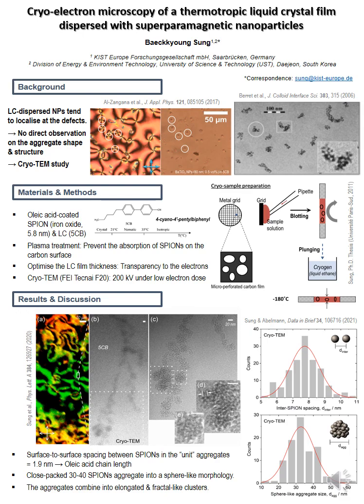In order to achieve this, Cryo-EM is the best method for direct visualization because the intrinsic sample properties can be fully maintained using cryo techniques. As seen in the second figure in the background, metallic nanoparticle clustering structures in aqueous solutions have already been imaged by applying Cryo-EM methods.